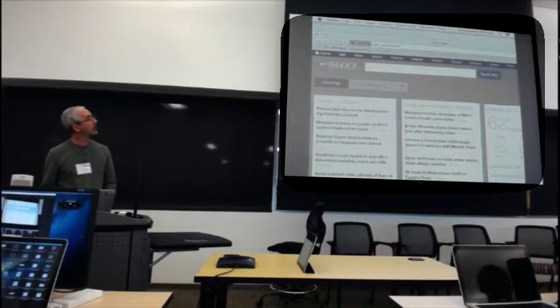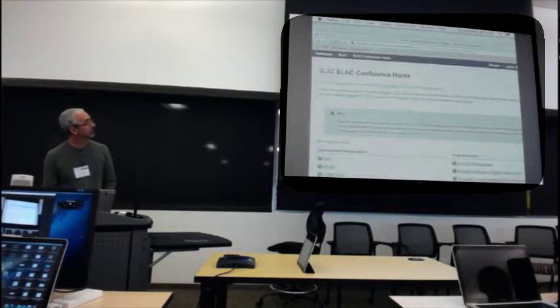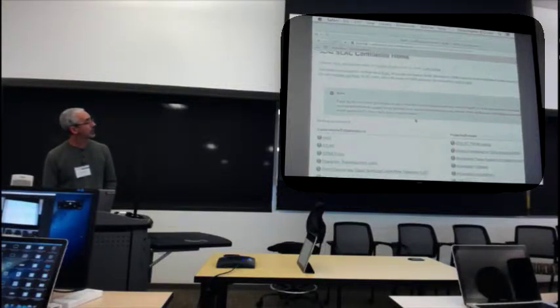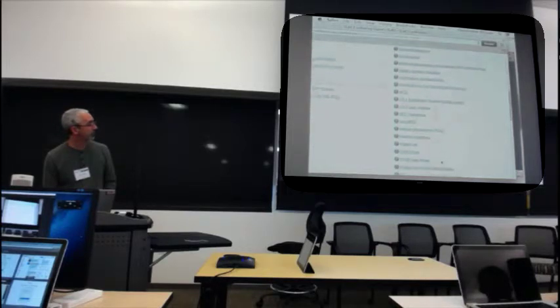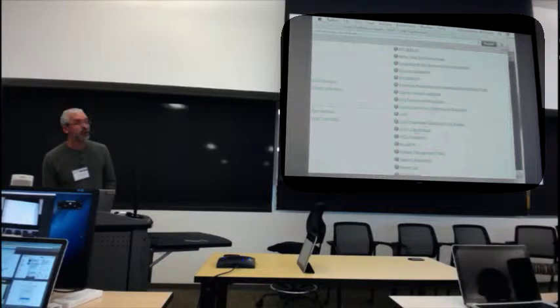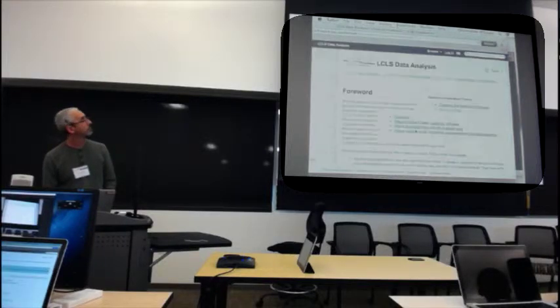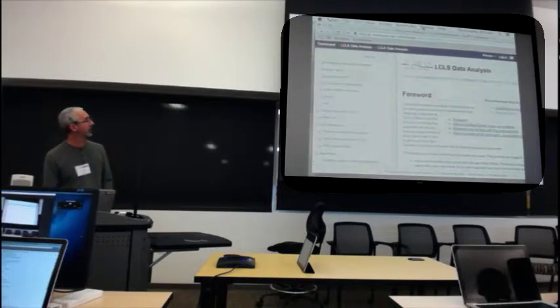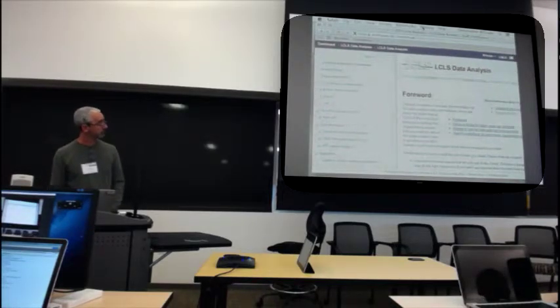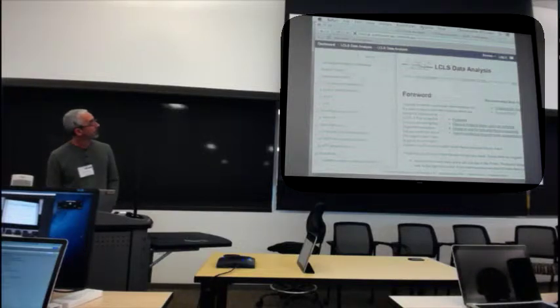This is being slow to load for me because everybody's doing it. The key point here is just to get logged into Psana, which many of you have already done, but we're going to step through it, especially since this is the first one of the day. Then on the right-hand side, you find LCLS data analysis. This is where all the documentation for Psana-style LCLS data analysis is. Then you go to the fifth one down and click on Psana Python interface.